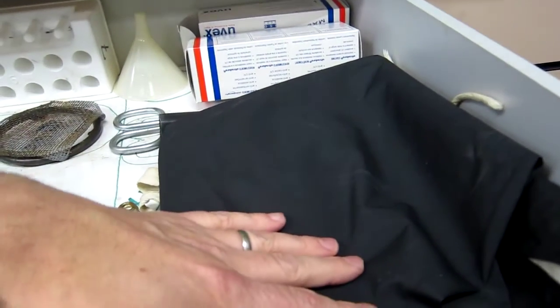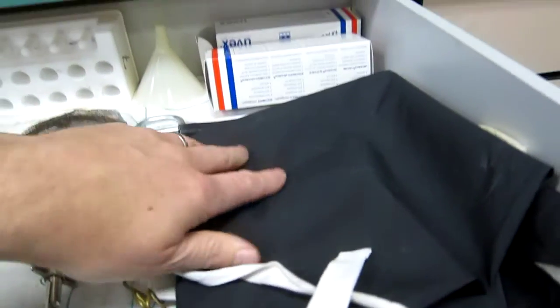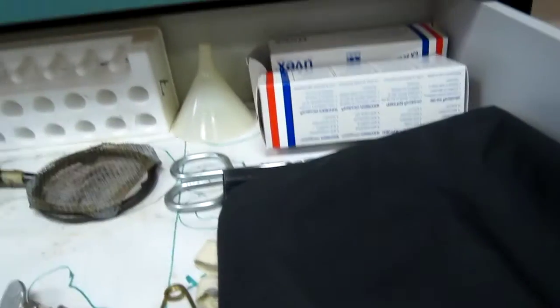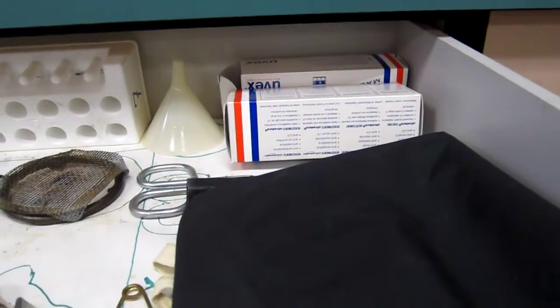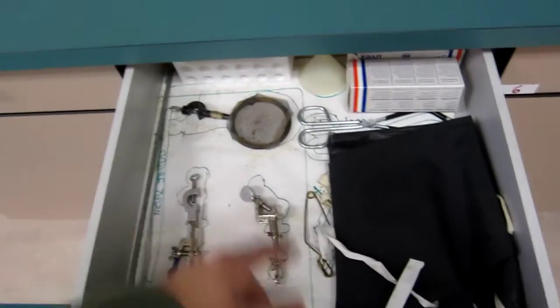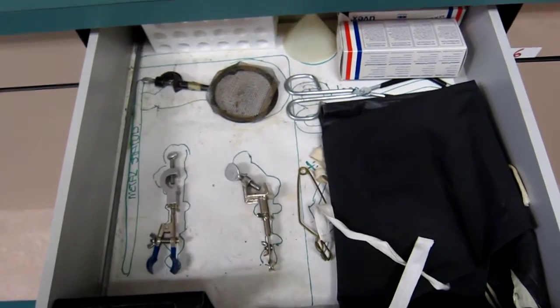Back to goggles and aprons. When you're done with them, they get folded back up neatly. You don't leave knots and things for people. You don't leave your goggles out of there so they don't get scratched. You just keep them in the boxes, please. Okay? And funnel in the back. Please use the pictures to put things back. And that's basically it.